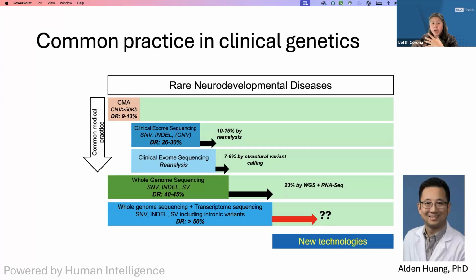So prior to sending it for sequencing, I highly recommend doing a whole genome sequencing reanalysis to make sure that it's negative, because we actually encountered one case that we sent. While I was analyzing the long read, I was also doing reanalysis of the short read, and I identified the cause by the reanalysis itself. So I recommend everybody do a fresh reanalysis prior to sending it for sequencing.